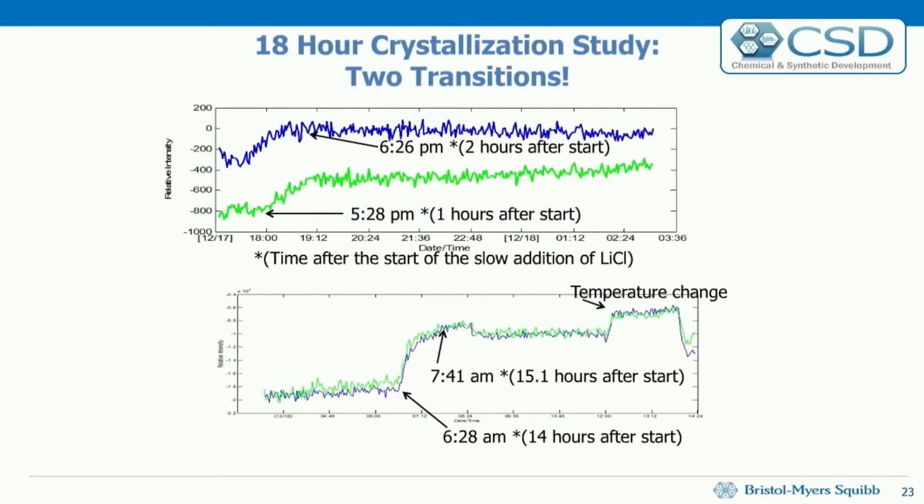This is another study, and this was another very dilute reaction, and it was kind of a lesson learned here for the scientists, the engineers. I put in the times here because the times are actually very important. Many times you want to start a reaction early in the morning, and by the end of the day, before you go home, whether it's 6, 7, 8, 9, 10 hours later, pull a sample, stop it, you're done. Your other option is to start it at the end of the day.